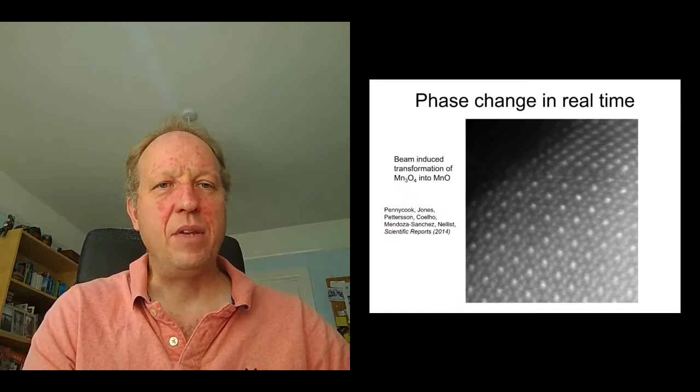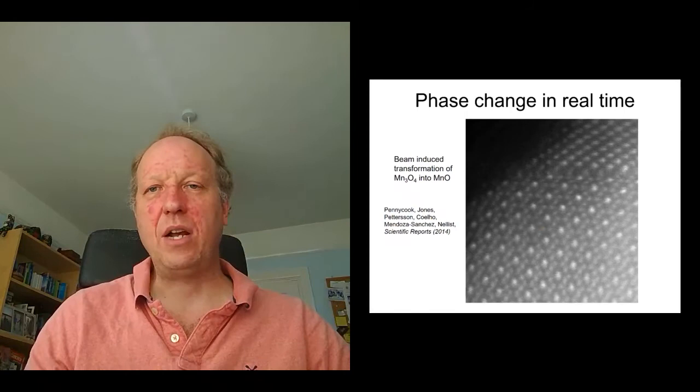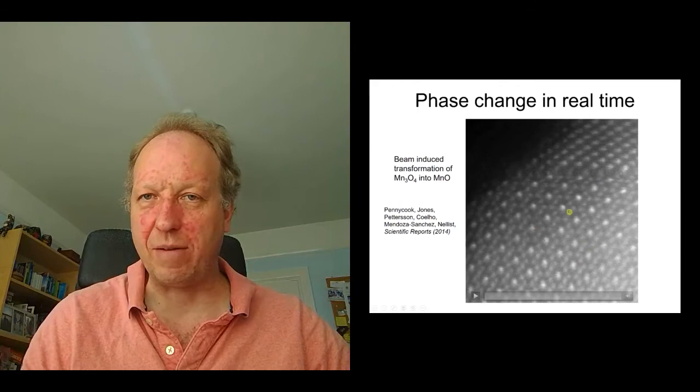Now what happens in this material, when we started looking at it in the electron microscope, the electron beam started damaging the material and it started transforming into MnO. So it's got a different stoichiometry, different chemistry, and the structure changes. This is a more complicated structure called a spinel crystallographic structure. This one's a bit simpler, and it's actually the same as rock salt, same as sodium chloride.